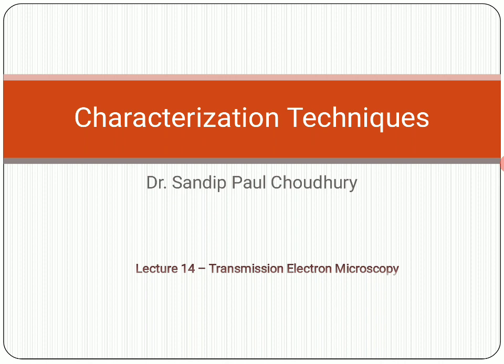But when we are talking about transmission electron microscopy, this family of signal is different from that. So that is the basic difference between these two, because the signals which transmit through the sample are used for transmission electron microscopy, and the signals which are going back in the same direction from where the incident electrons have come will be used for scanning electron microscopy.